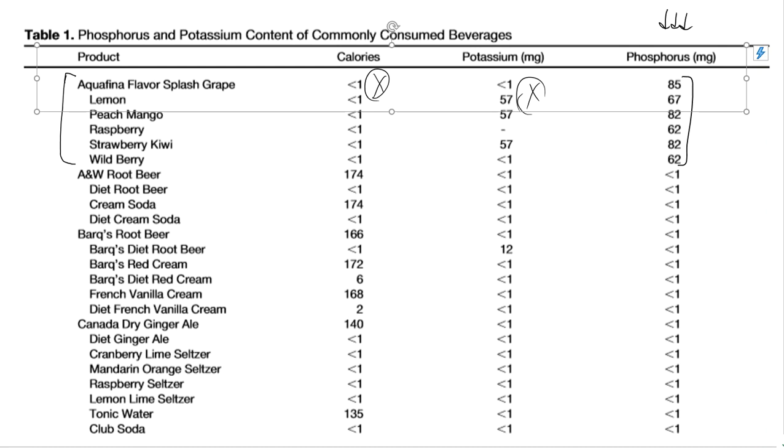It's just got a little bit of flavoring in it. Strawberry kiwi, I mean, perfect for summertime, right? Well, not necessarily. If you're looking for phosphorus, this is going to be a product that you would want to stay away from. And it's water. It doesn't really even fit any of those criteria that I showed you in those previous slides.